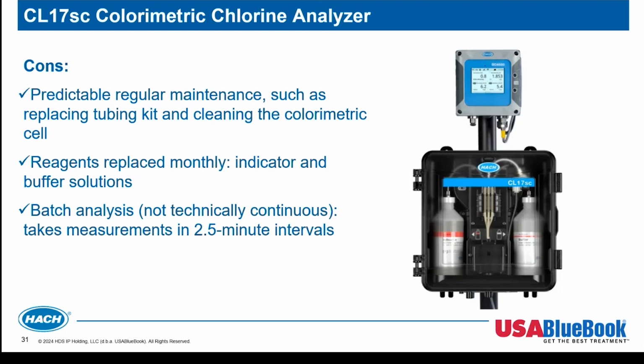And that's something I normally recommend to do every time you do a reagent change, which is another sort of con. We do have reagents in this instrument, an indicator and a buffer. So of course that has a cost component. It also means that there's some reagent in our waste stream that we have to account for.